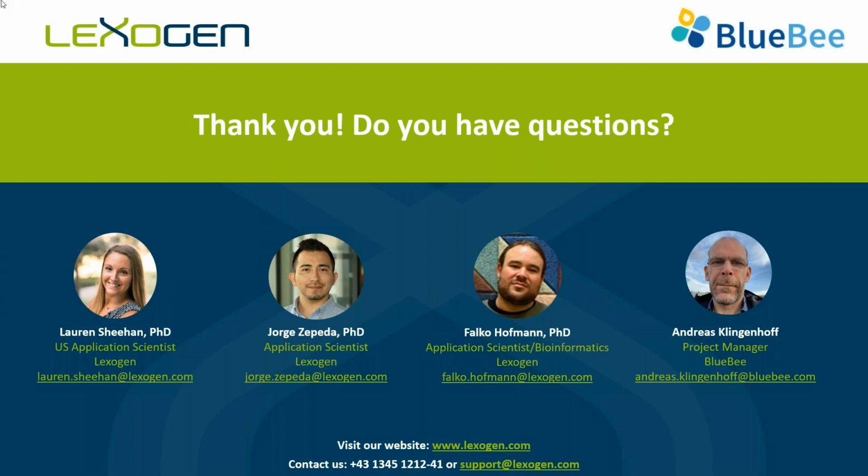All right, so our first question: does this platform analyze data from dicot plants? Right now, we currently do not have dicot plants on our reference genome list, but this can be implemented. So again, like I said, if you want to upload or have a reference genome added, you can contact us at support@lexogen.com.